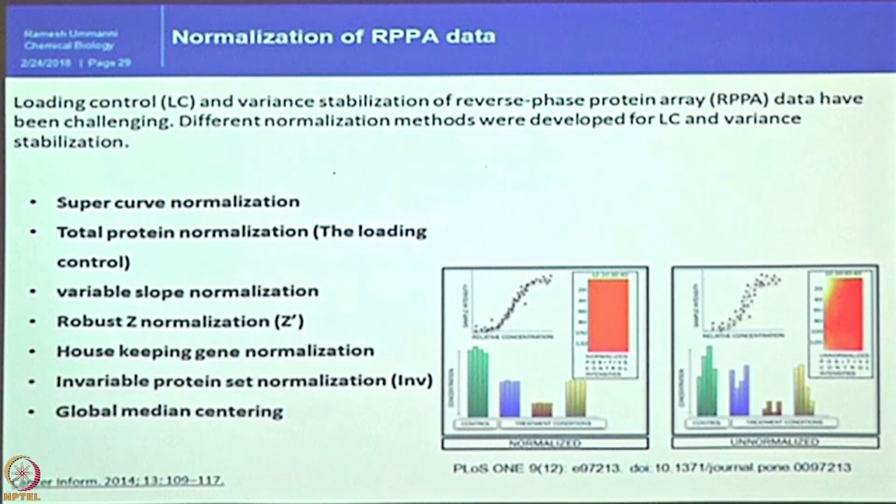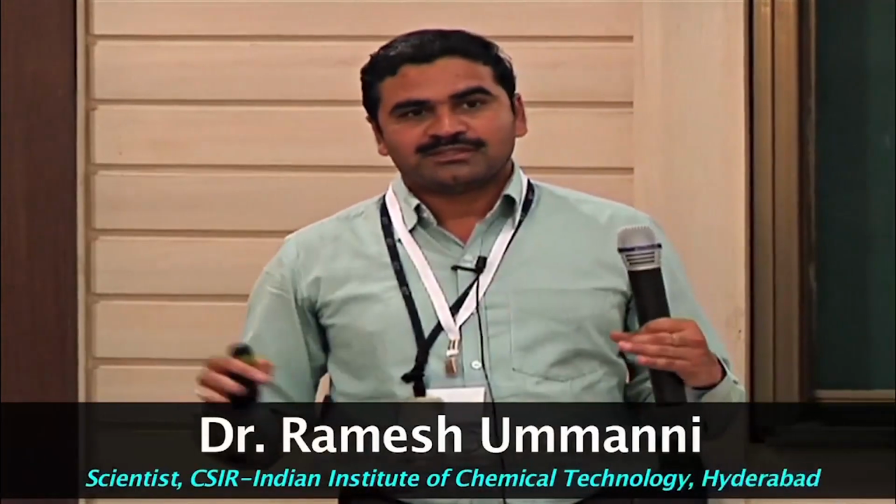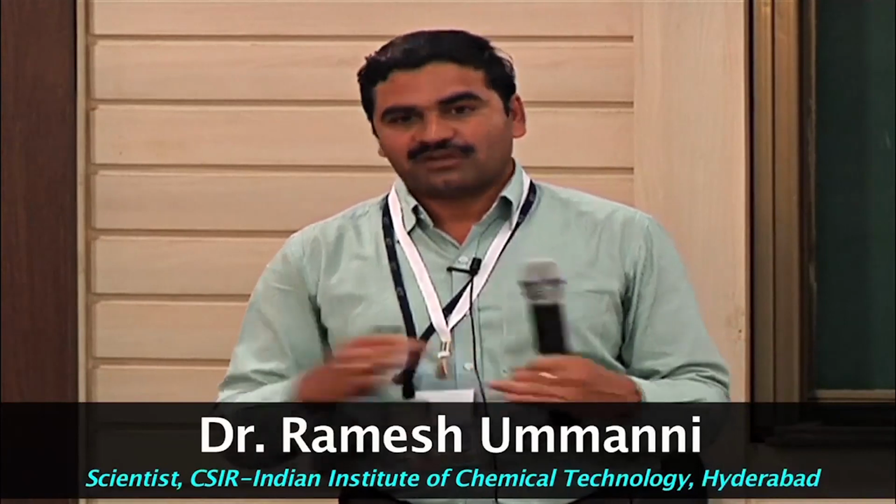One of the methods we follow in Western blot is housekeeping normalization. We are all fond of using GAPDH more than the target proteins, very often. And then there is invariable protein set normalization. This means that in all the 1000 samples, we know that one particular protein concentration will not change, so that will be set as a landmark. Some of you might have done 2D gels in the early days of the proteomics approach, where we used to set landmark spots. In the same way, proteins expected not to change across the sample set will be set as landmark spots. Based on those concentrations we can normalize.